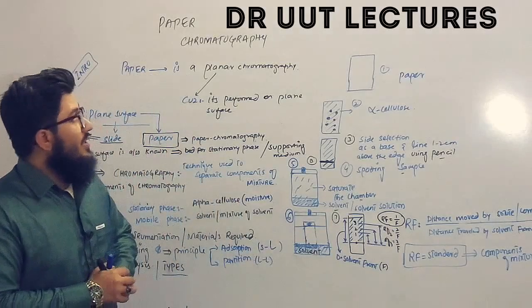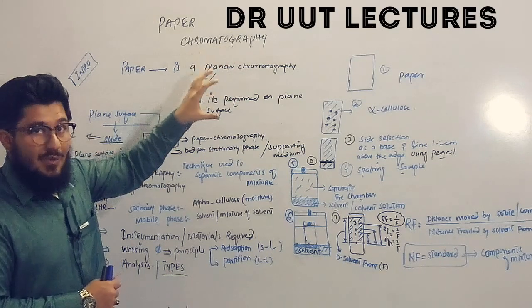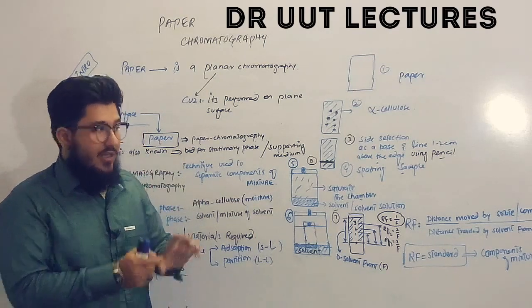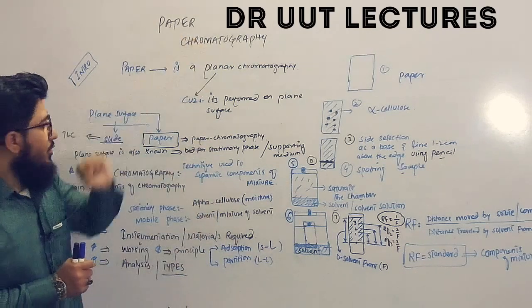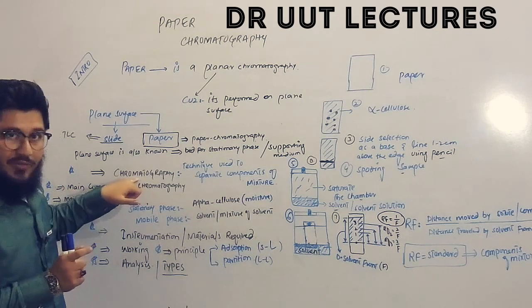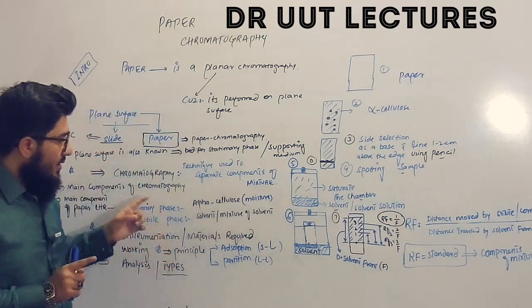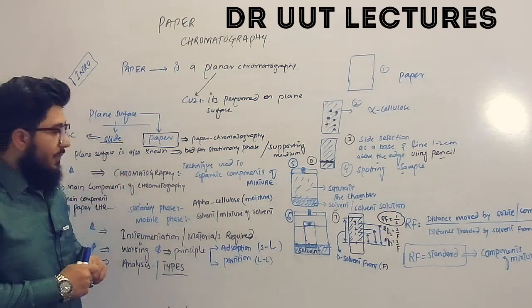In today's tutorial, we will discuss paper chromatography, and we will start our discussion from the introduction of paper chromatography. Before I start, I would love to mention that today we will learn the introduction of paper chromatography, a short introduction of chromatography also, and after that we will know about the main components of any type of chromatography. After that, we will talk about the main components of paper chromatography.